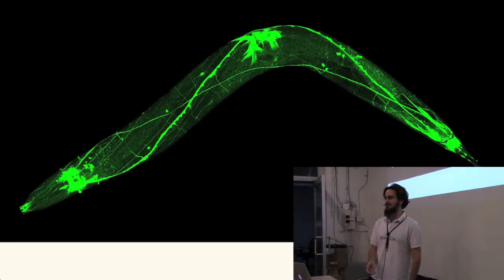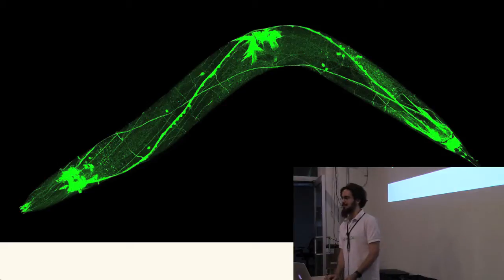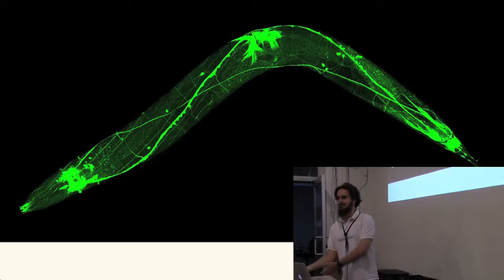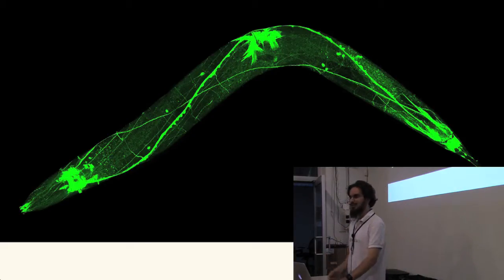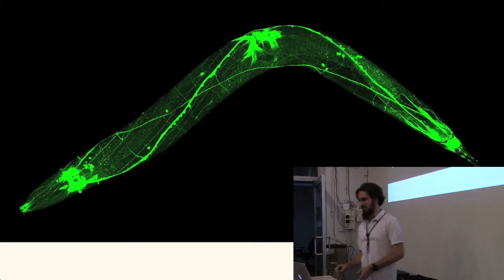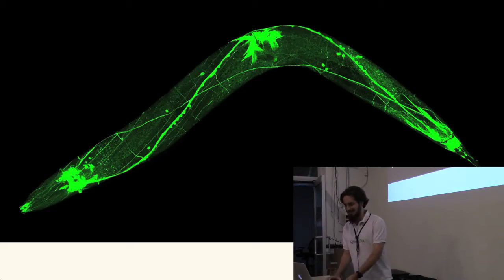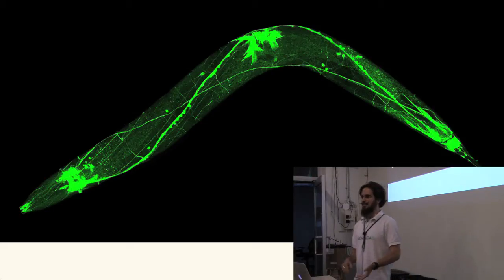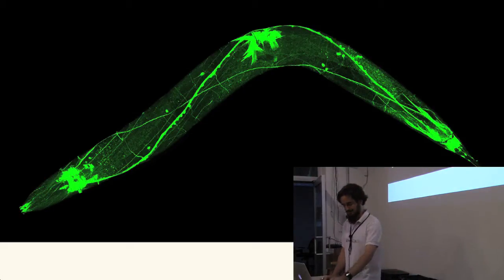And we now have the tools to do that using fluorescence, because the worm happens to be optically transparent, and we can put in optogenetic molecules which bind to calcium, which is a proxy of neural activity, and fluoresce more when there's more calcium. So they're brighter when more things are happening there. And if we take the hypothesis that each of these neurons, fairly simple, not many dendrites or anything, is actually only representing one variable at a time, which is an extremely common assumption in the land of artificial neural networks, then we should be able to extract all of the information we want if we can control and image each of the neurons in this optical method.